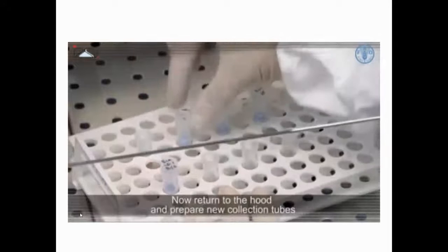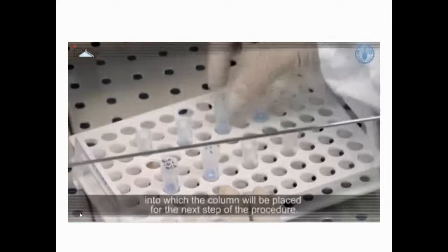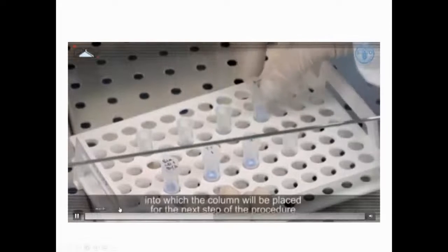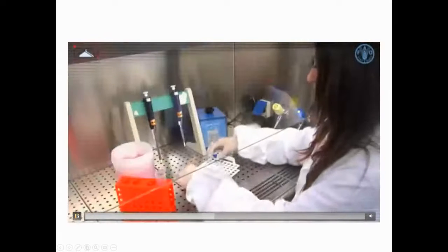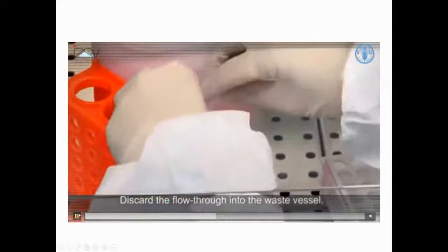Now return to the hood and prepare new collection tubes into which the column will be placed for the next step of the procedure. You see, she removed, after the centrifugation, everything goes through the filter and then down to the bottom in this tube, in each of these tubes. And now she removed this column, moved to the new tube, removed the column, and then put the new tube. And you're going to discard this flow through, all right? We keep the column because all the nucleic acid is in the column now. Discard the flow through into the waste vessel.